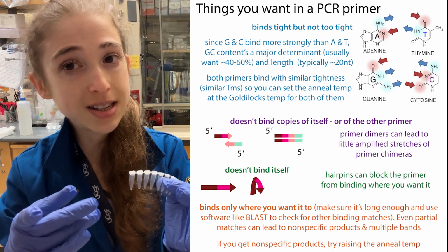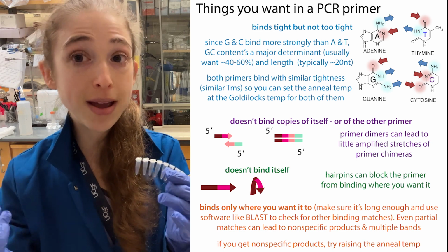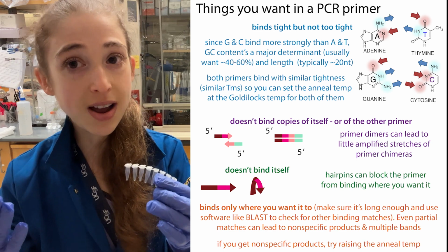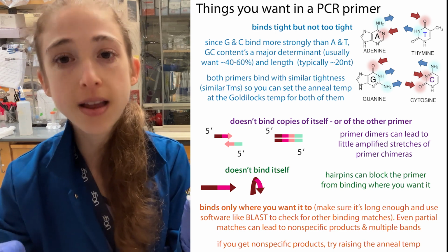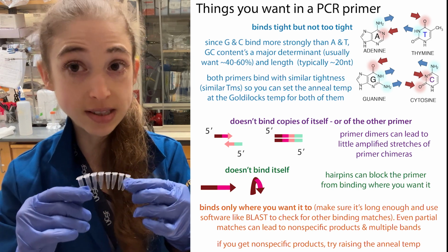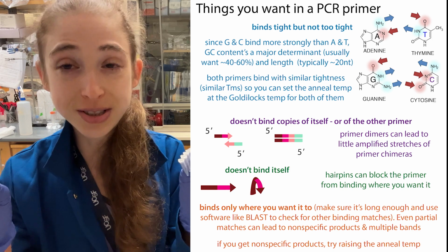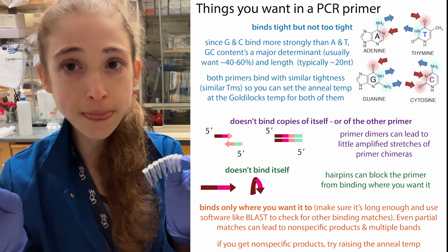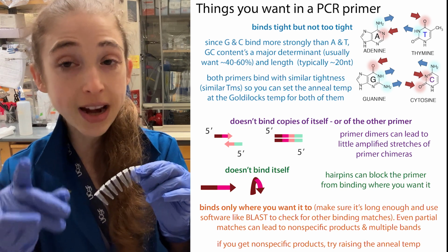If you're using a plasmid, you might not expect there to be E. coli genomic DNA in there matching to your stuff, but that can also happen if you don't do your miniprep well and things like this. So increasing the length increases the TM, and also increases the specificity by making it harder for it to just randomly occur.